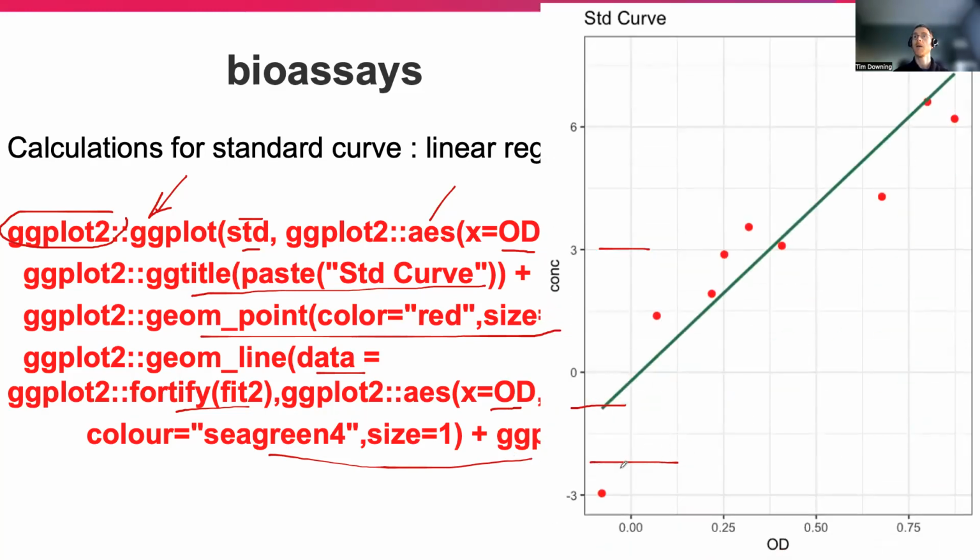So it's actually the same data we had before when we did our sigmoidal curve, and it was shaped like this. So we can fit different models to our data to see what's the best fit depending on what you're looking at. So let's now switch over to R to explore this further.